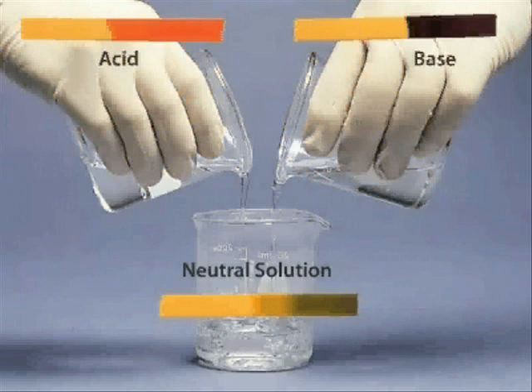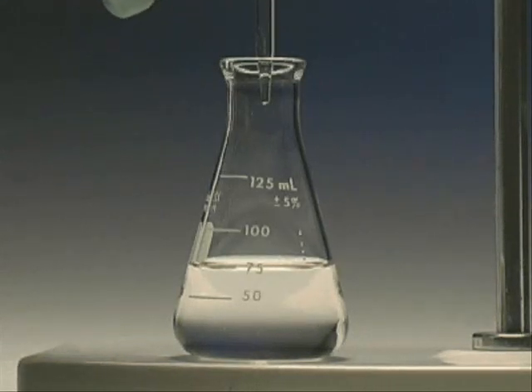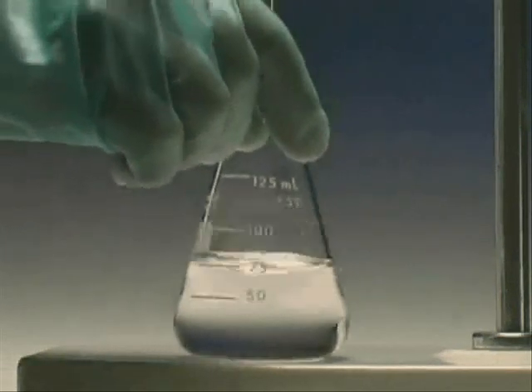When an acid and base are combined, a neutralization reaction occurs. The point at which both are neutralized is called the equivalence point. In a titration, very small amounts of one solution, known as the titrant, are added to another solution until the equivalence point or neutralization point is reached.